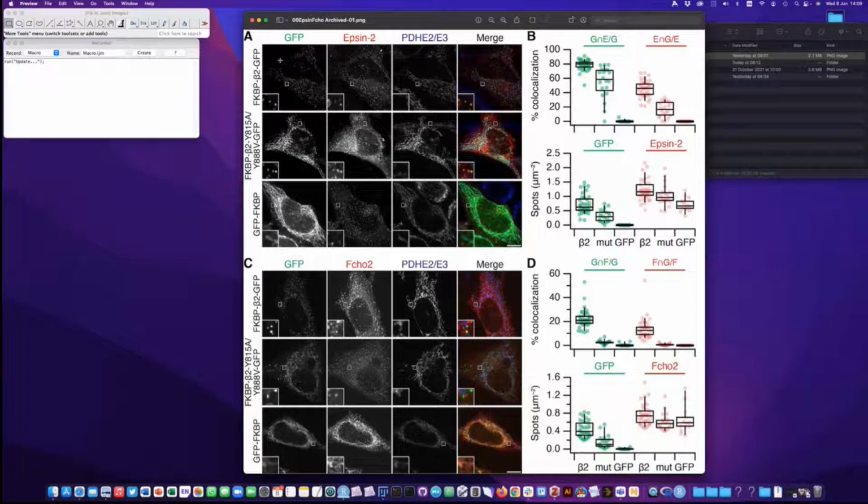Then what we would do in Illustrator is do the labeling. So none of that is done in Fiji because you get higher quality in Illustrator. We do the big labels on the top, and these would be made in another program like R or Igor or something. We would drop these in as a PDF. Everything is kind of scaled so that we're doing minimal messing around in Illustrator, and that's the way we make the figures in the lab.